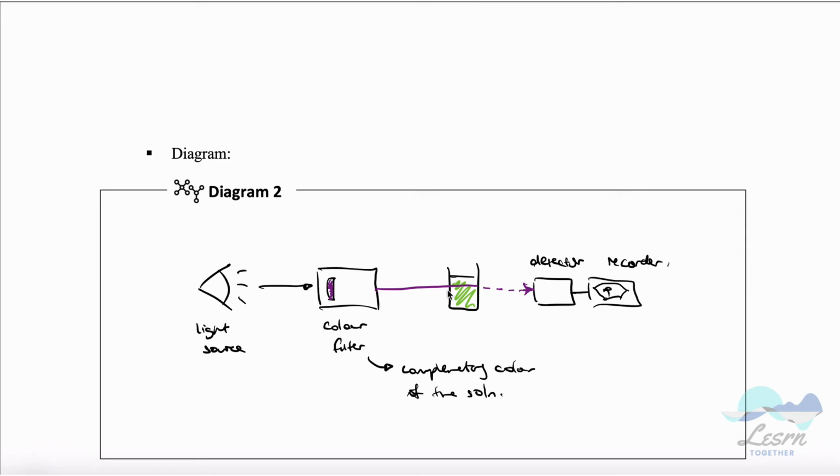So depending on the concentration of this sample, the higher the concentration, the more it's going to absorb, right? Because the stronger the color, the more it's going to absorb. And so that's why at the detector, you're going to detect less, and you'll correlate that with a certain concentration. If you have a really dilute sample, then it's not going to absorb that much of this light. And so the detector is going to detect a high signal because there's not that much absorbance, and you correlate that with a particular concentration, okay? And so because it's based off how much this sample absorbs, we want to pick the color that's going to give it the best chance to absorb. And the color that gives it the best chance to absorb is the complementary color, okay?